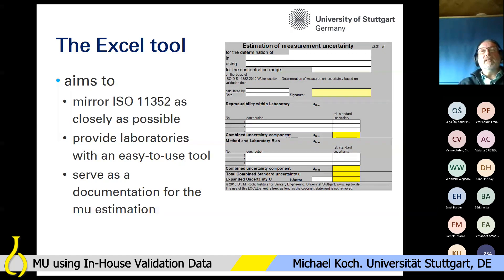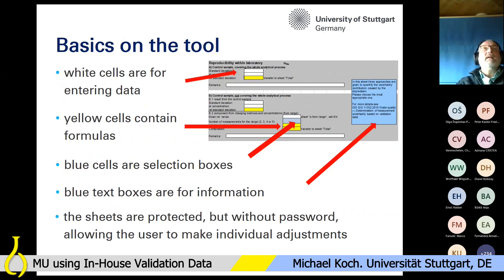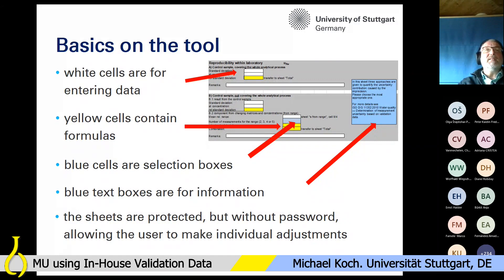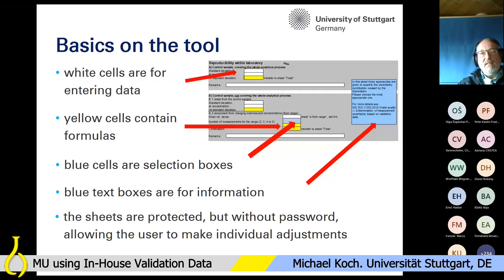Then everything is available when the audit starts. Regarding the basics of the tool: it's based on Excel. We have white cells where you can enter data, yellow cells that contain all the formulas, and blue cells which are selection boxes where you can select a value. The blue text boxes give some additional information.